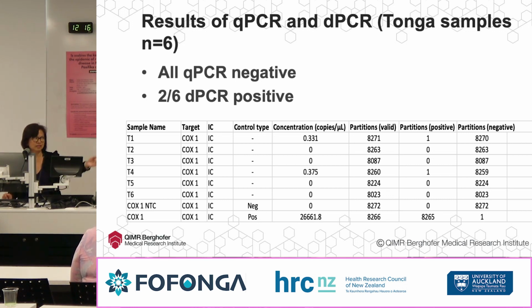So he was a bit concerned. Why are they negative? Okay. Then I said, I don't know. DNA can be pretty stable, but as I said, qPCR can also be subjected to inhibitors. And now that I'm doing this optimization for the digital PCR, the newest technology, let me have a look again.